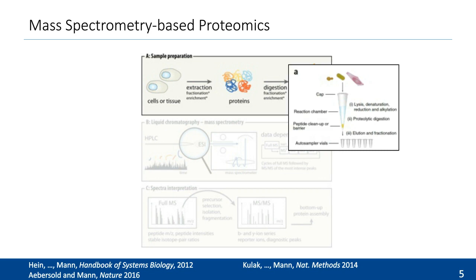The cool thing is that the technology has now developed so far that the sample preparation can be done in a single vial, or in this case shown in a StageTip, by the in-StageTip method introduced by Nils Kulak and Matthias Mann a few years ago.